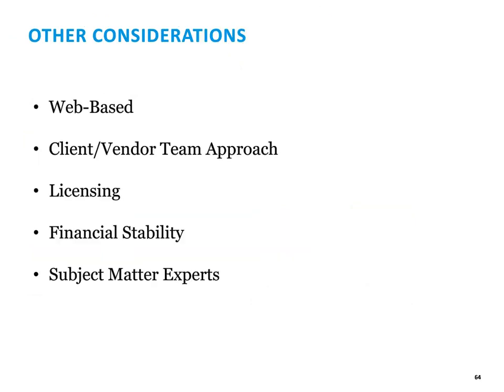And finally, just a couple other things to think about. Is it a web-based system? Web-based systems are really the way everybody's going today because you don't want to have to go client by client, or I should say PC by PC, computer by computer, installing software. If it's web-based, you don't have to do that.